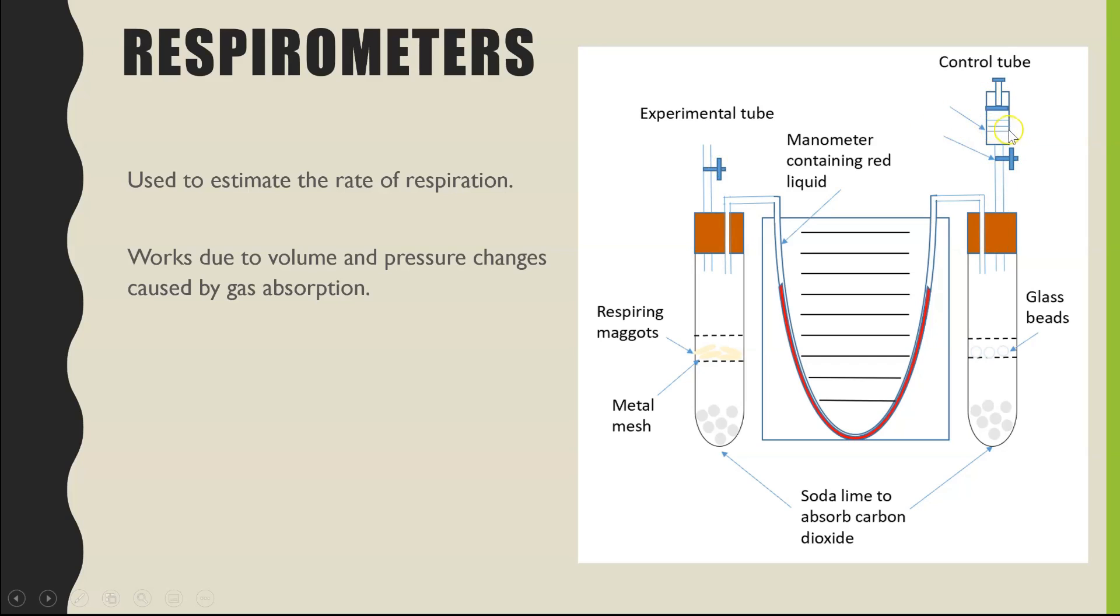And on the control tube we also have a syringe. Now the point of this is you will need to, if you want to do repeats, reset your equipment. So you can move the colored liquid back to the start point whereby both points are at exactly the same level. And you can do this by either pulling up or pushing down on the syringe to change the volume of gas inside and therefore move the liquid back to the start point.